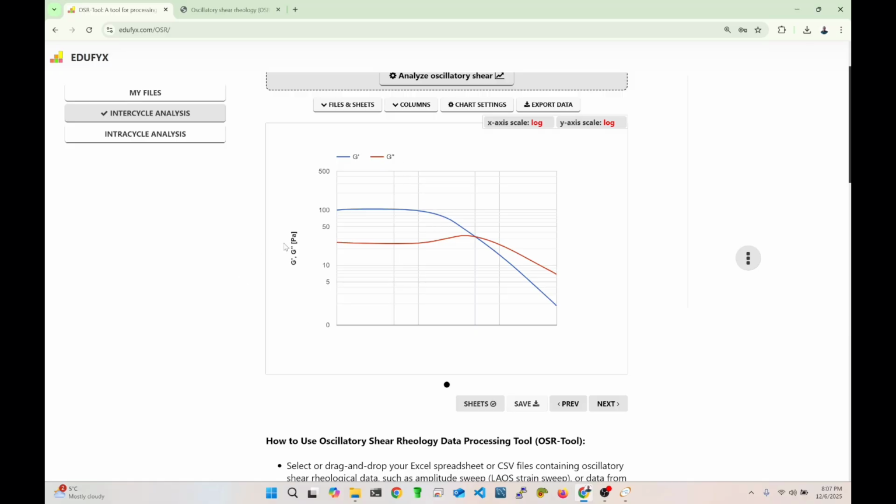So I added this and this, but this is just to visualize your data before you export and plot with your favorite plotting tool. I notice that the x-axis label did not show up, probably because of the log axis, but you understand what is going on, I believe.